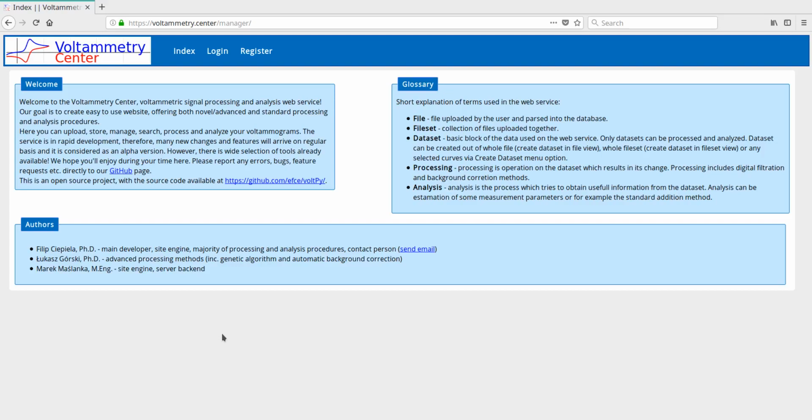Welcome to the introductory video about Voltammetry Center. Voltammetry Center is a web service that allows you to store, manage, search, process and analyze your voltammograms.